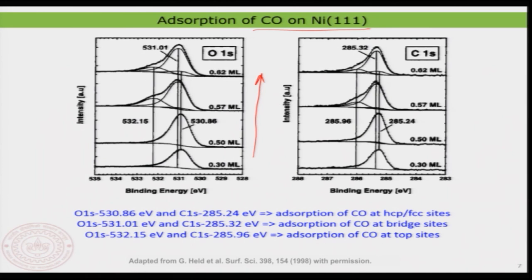I can always look at the oxygen or carbon, because whenever the carbon is affected, so this is my nickel, yeah, whenever the carbon is affected, of course the oxygen is also directly influenced. So that's the point. When carbon is strongly bound, then the oxygen resonance should also change. So that's exactly what you are seeing here. As the coverage increases, you see new resonances appearing that correspond to the occupation of the molecules at the top site. Yeah, so that's the interesting aspect in this case.